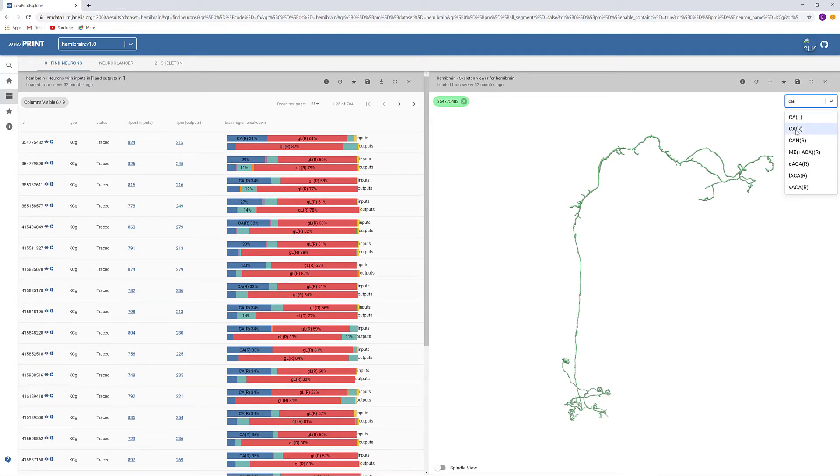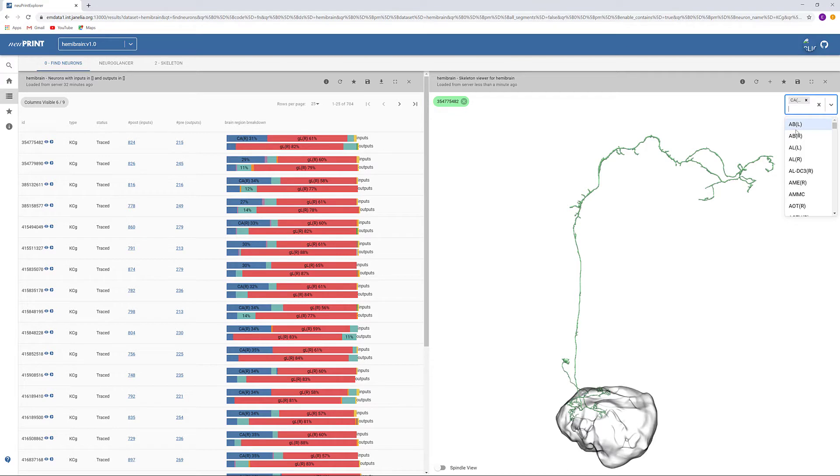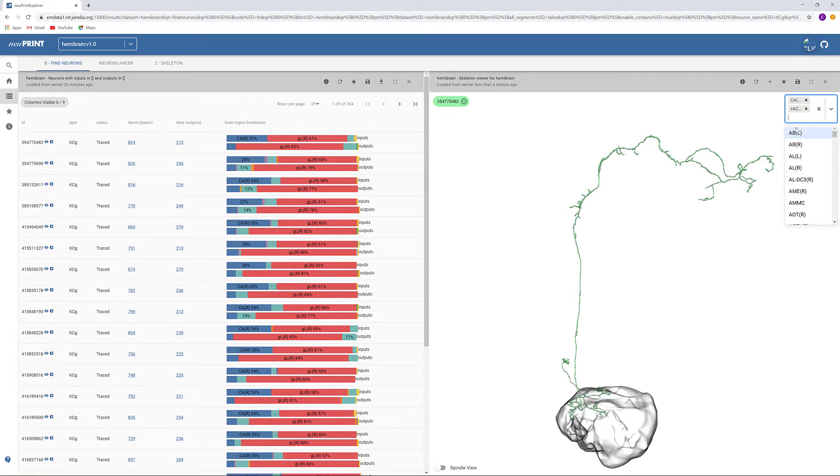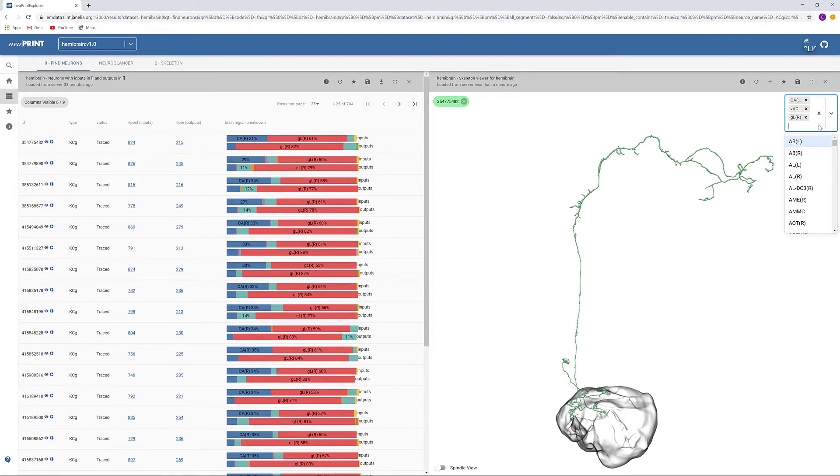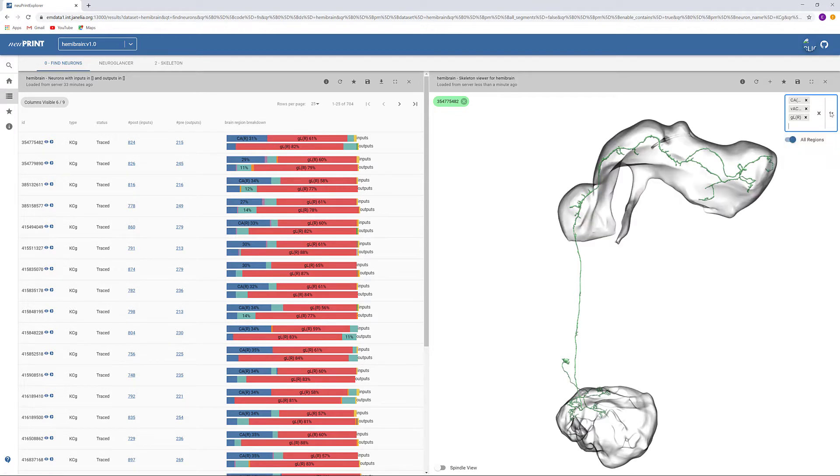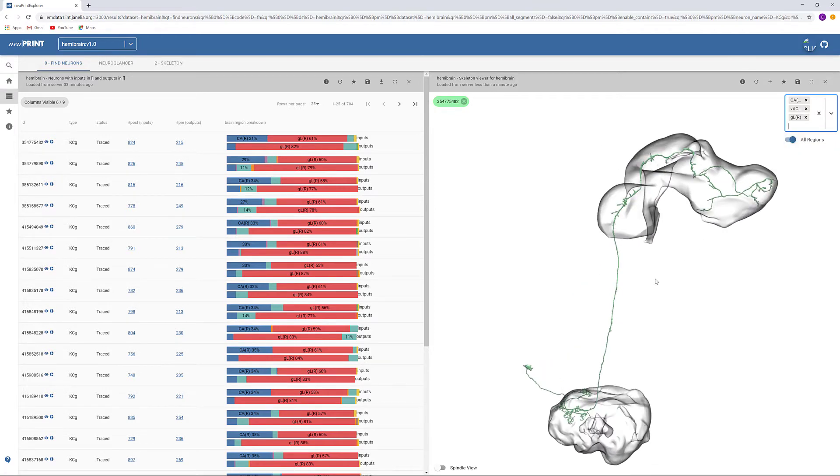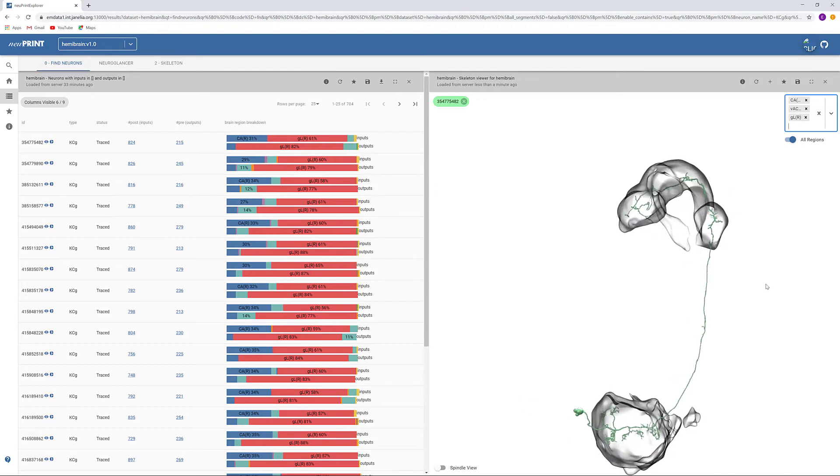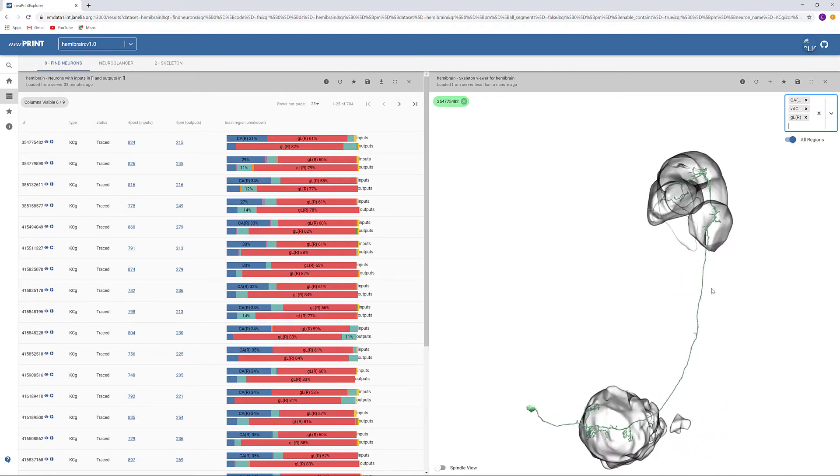We can check if this neuron is postsynaptic in the CA or VACA and presynaptic in the GL by pulling up those regions on our skeleton. And here we can see that this neuron is doing just that.